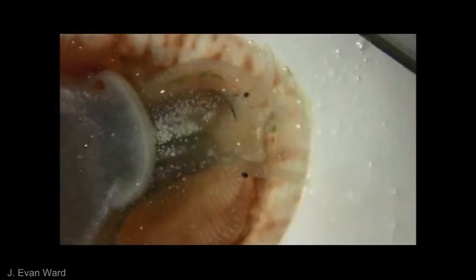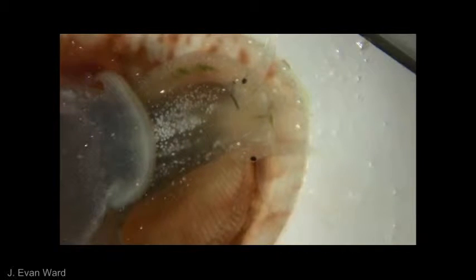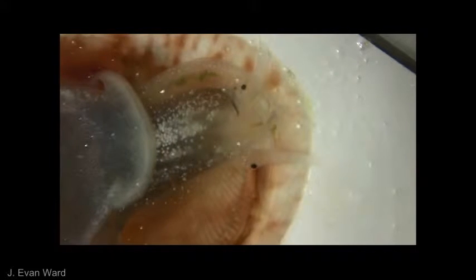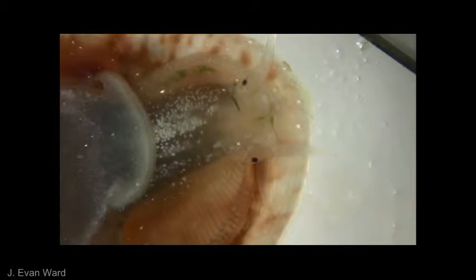Here we see a snail feeding on the microalga Tetraselmis. The interior portion of the snail is visible, including the head, which is about 2mm in width. The mouth is to the right. The food cord, which is green in color, is forming in the neck canal under the right neck lobe. The cord is formed from material being transported off of the distal edge of the gill. The proximal half of the gill can be seen in the bottom of the video and runs up over the head.